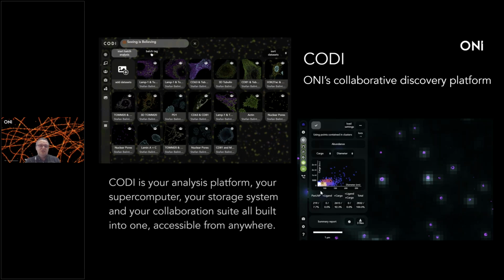This is the type of widget that you can see here. On the bottom, for example, it will show you what percentage of these particles are actually pan-LNP, or in this case a surface marker, or which are cargo and ligand positive. And at the end, you can download all this information. When you download it, you end up with a CSV or a text file, which you can open in Excel.